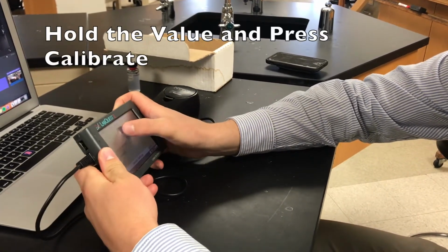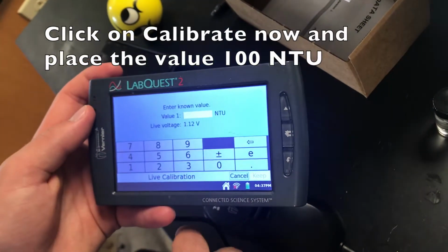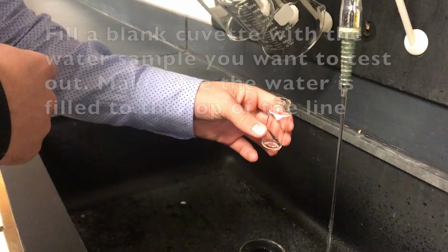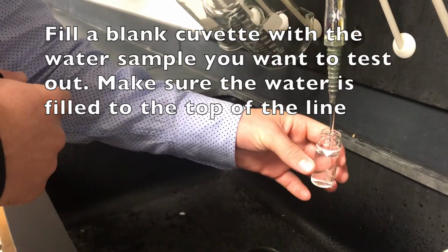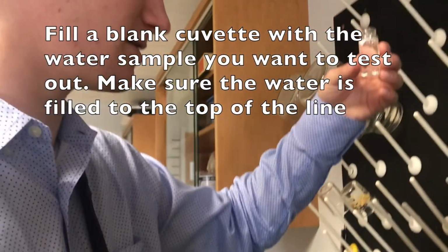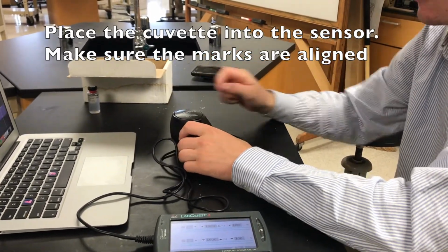Calibrate now. Calibrate now. 100. Place it in, make sure the arrows are aligned, and don't leave any finger marks.